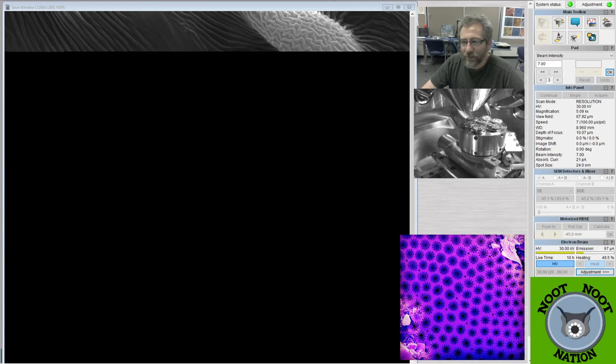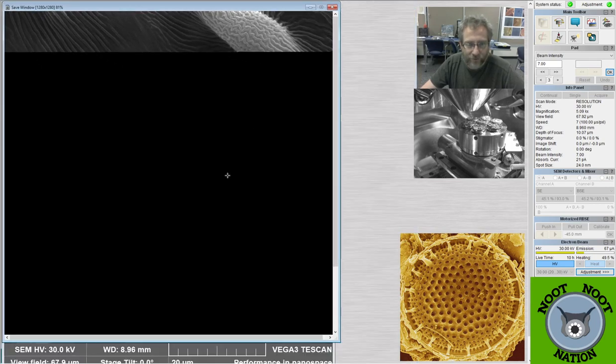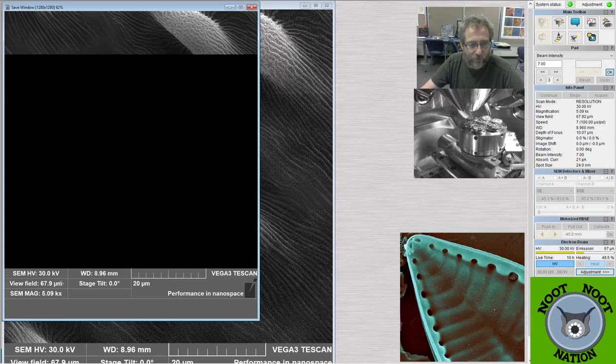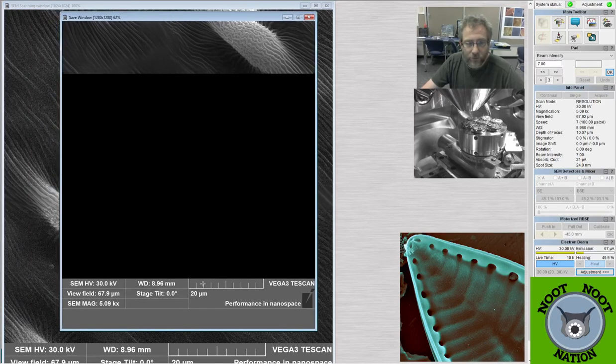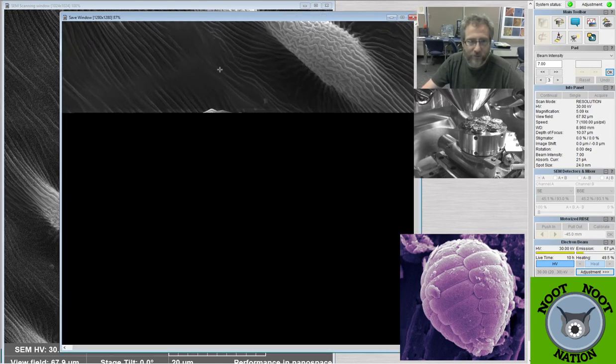Bioballs, what scale is this? You can see the scale, if I zoom out, right here. This is 20 microns. The entire field of view from one side of the image to the other, in this case, is about 65 microns across. So you can always see the scale on any image. When I'm streaming it, it's down here. But when I take the picture, it takes a while before it gets down to it because it's zoomed in.